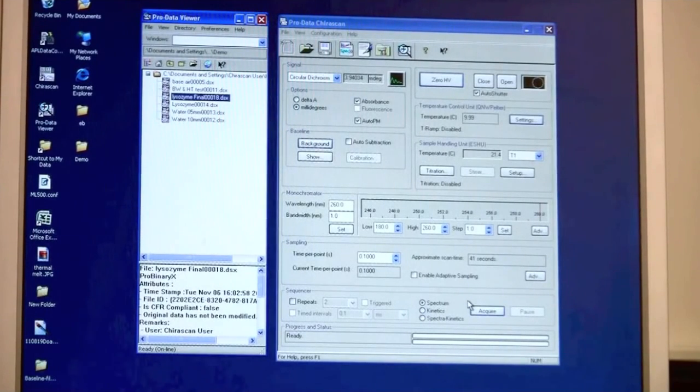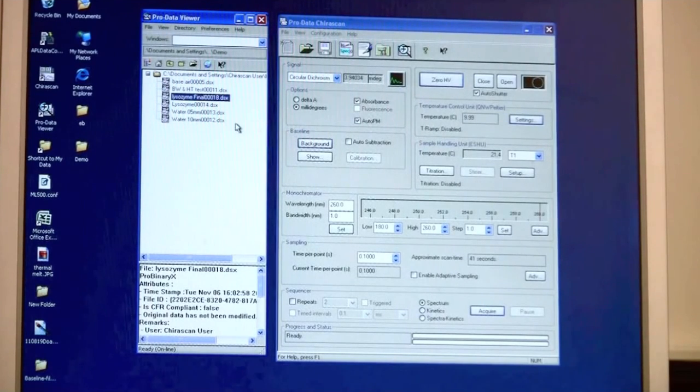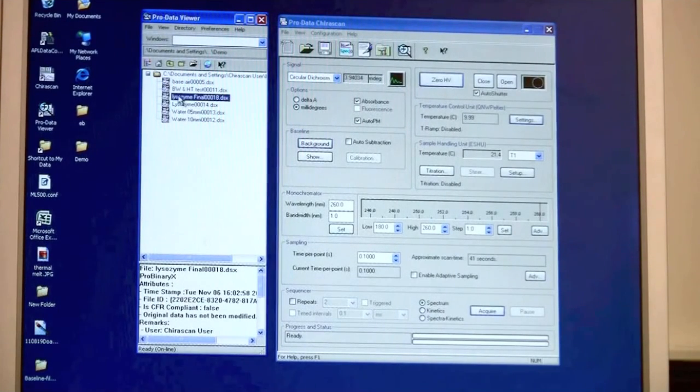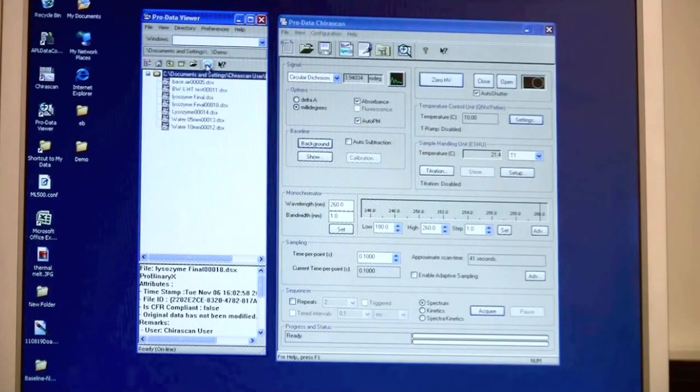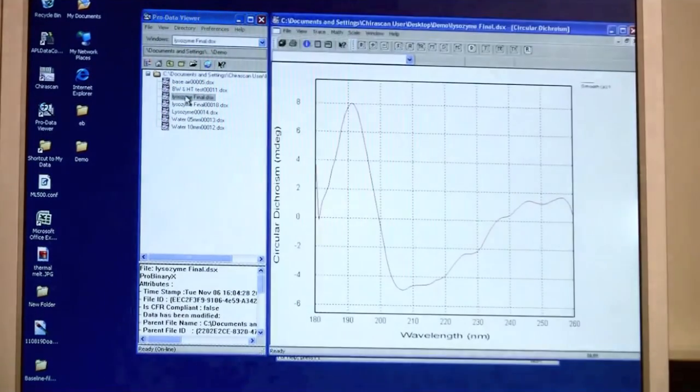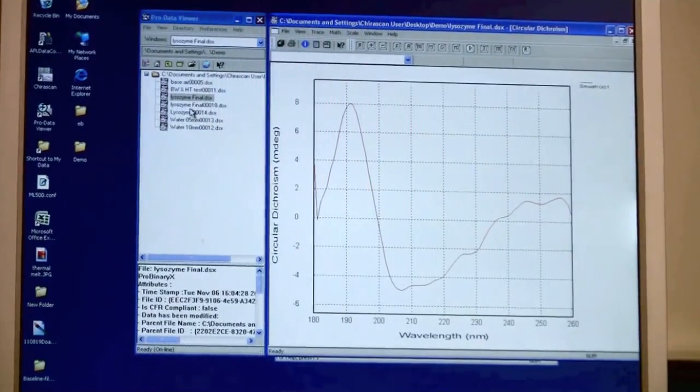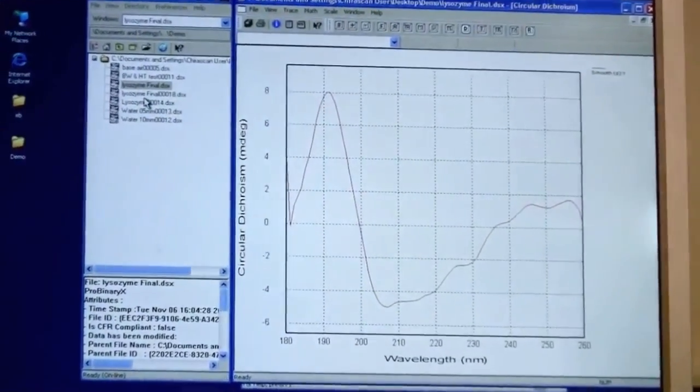The data that I have acquired based on my previous data is this data here. And that is then the CD spectra.